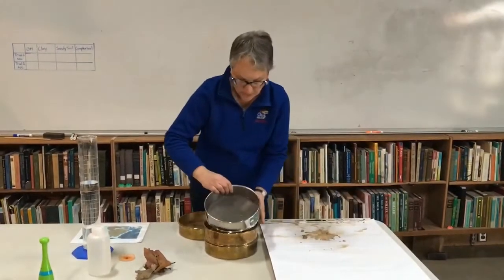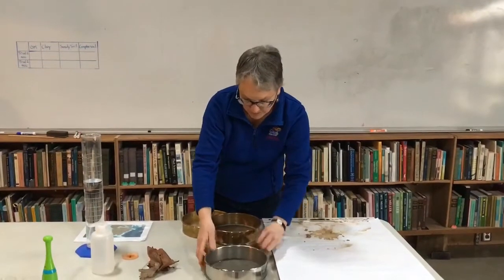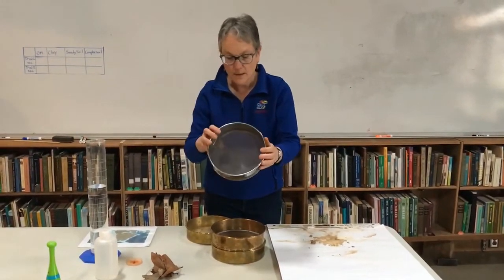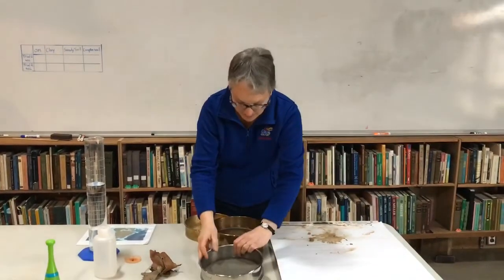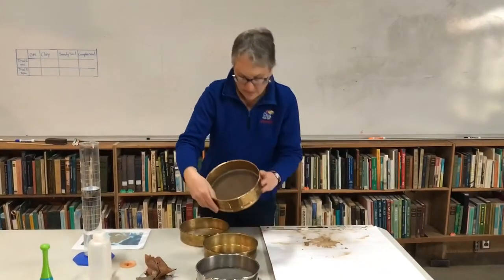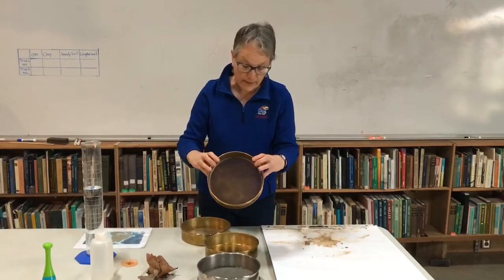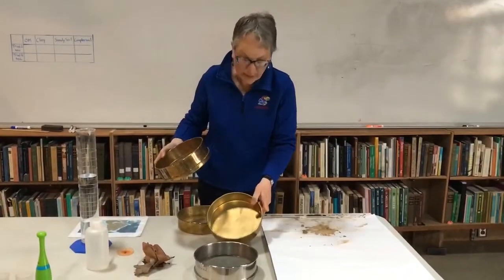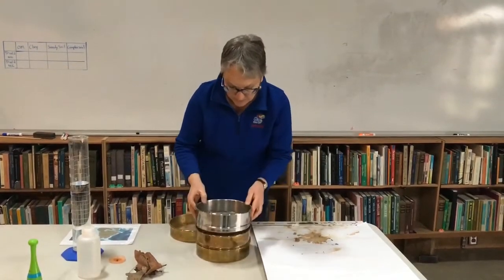So let me show you what they look like. There's the biggest size, and you can see that they've got little holes in them. And this is about 1.4 millimeters each space. And this space is even smaller. This is about half of that, 0.5 millimeters. And then this is the pan that we're going to catch everything that's left over in. So we're going to put these together.